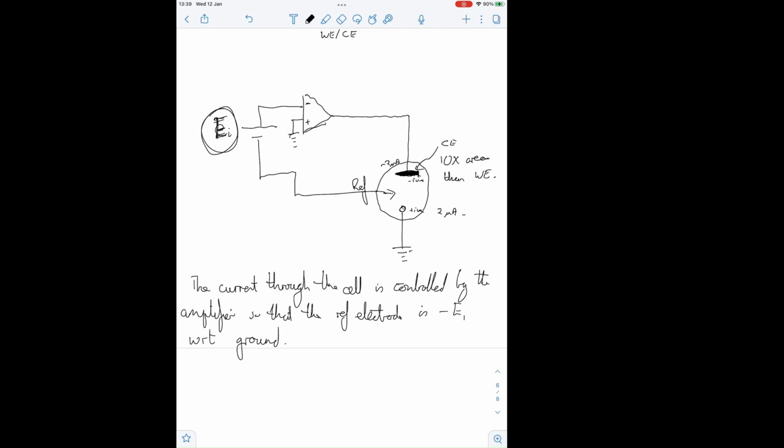Well, if it was a very, very small electrode, I might have to go to 5 volts to get that. And if I have to go to 5 volts, then I'm going to be breaking down my electrolyte and my solvent. At 5 volts, most solvents start breaking down. So if I'm using an organic solvent, I might be making some really nasty organic molecules at my counter electrode.